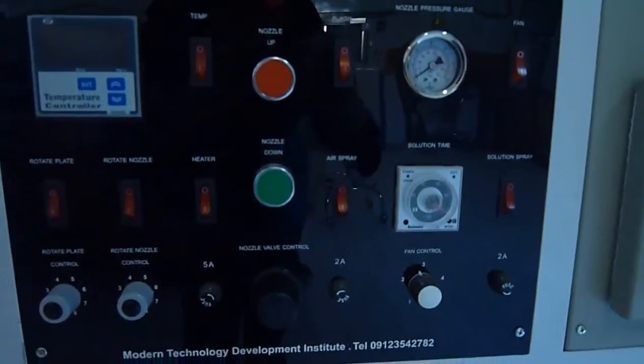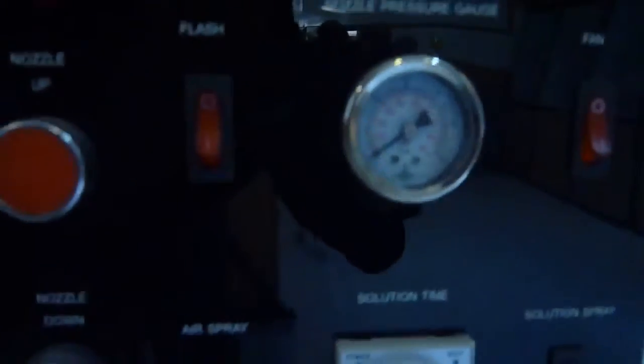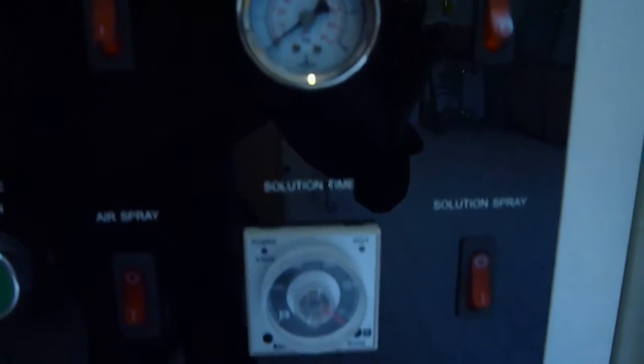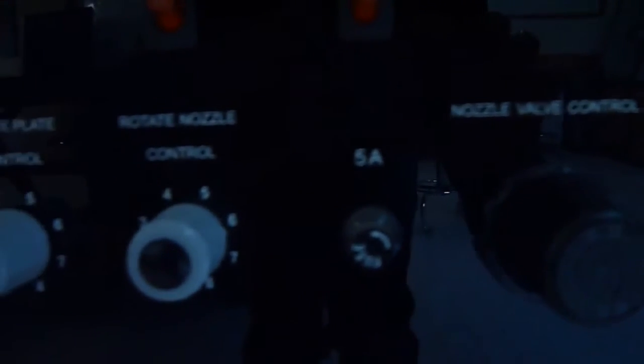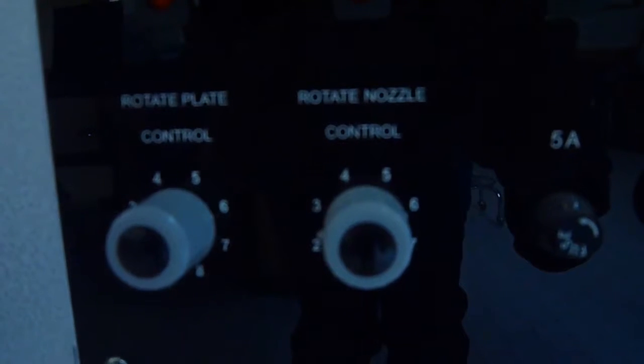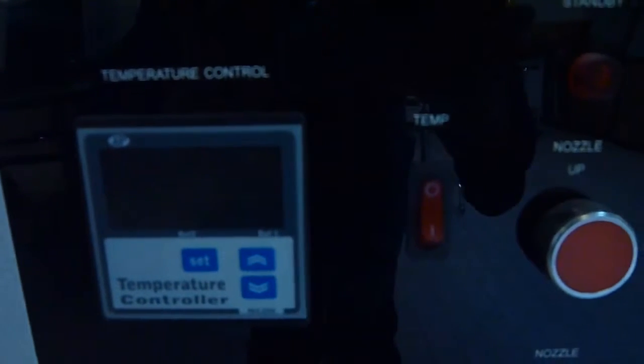This is spray pyrolysis deposition equipment, and it's the main method which I have used to obtain significant results in my master project. During the last several decades, coating technologies have garnered considerable attention, mainly due to their functional advantage over bulk materials, processing flexibility, and cost considerations.